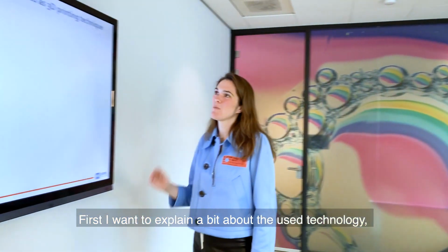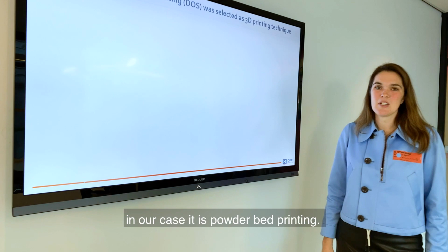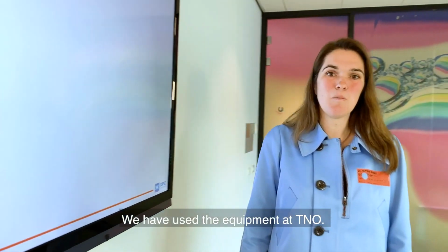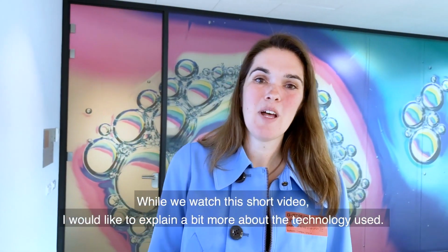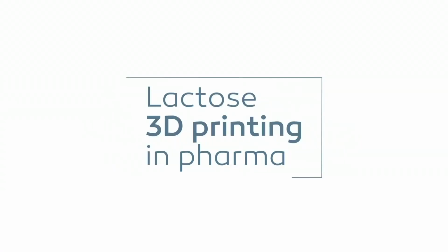First, I would like to explain a bit about the used technology. In our case, it's powder bed printing. We've used equipment at TNO. And while we watch this short video, I would like to explain a bit more about the technology used.